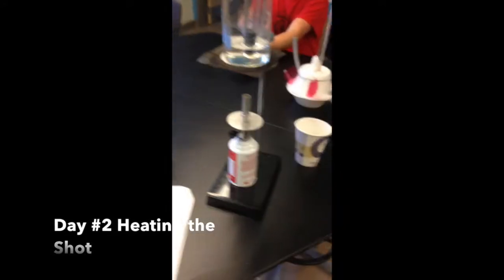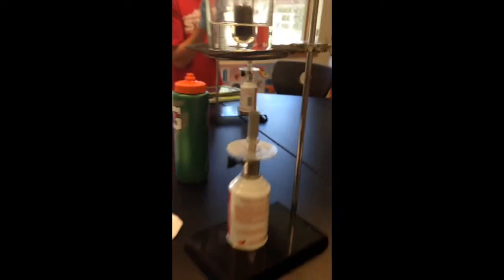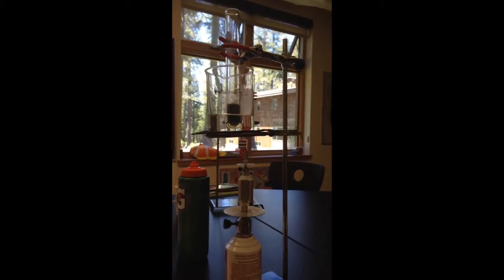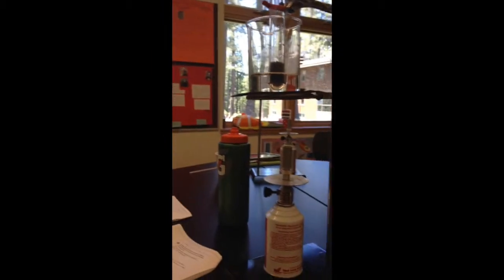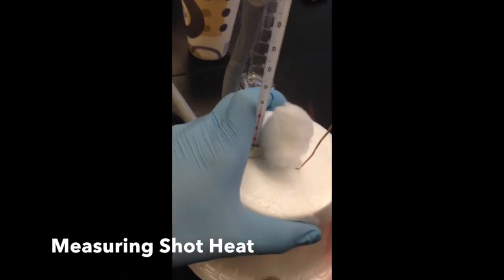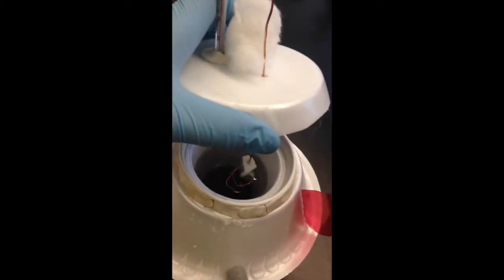Here we are heating our second lead shot up to boiling point, and then we'll put it into the calorimeter to check the specific heat of this particular lead shot. Now we're measuring the second sample of lead shot in our calorimeter.